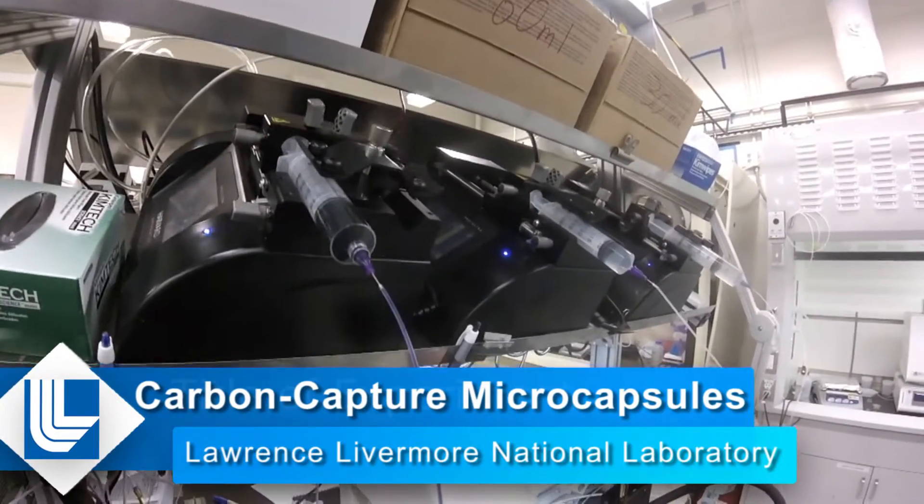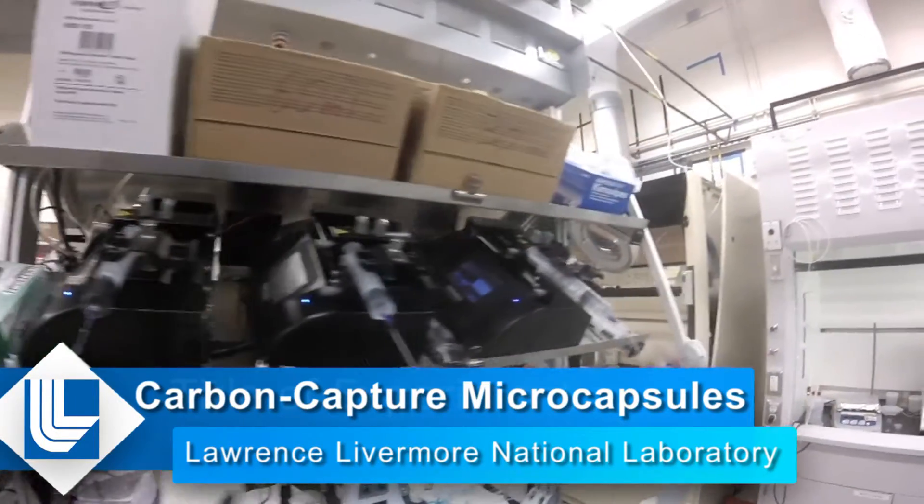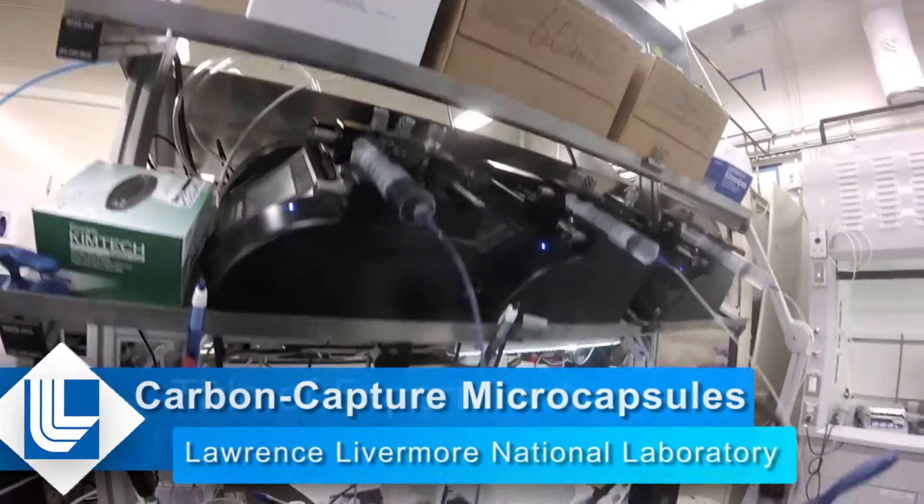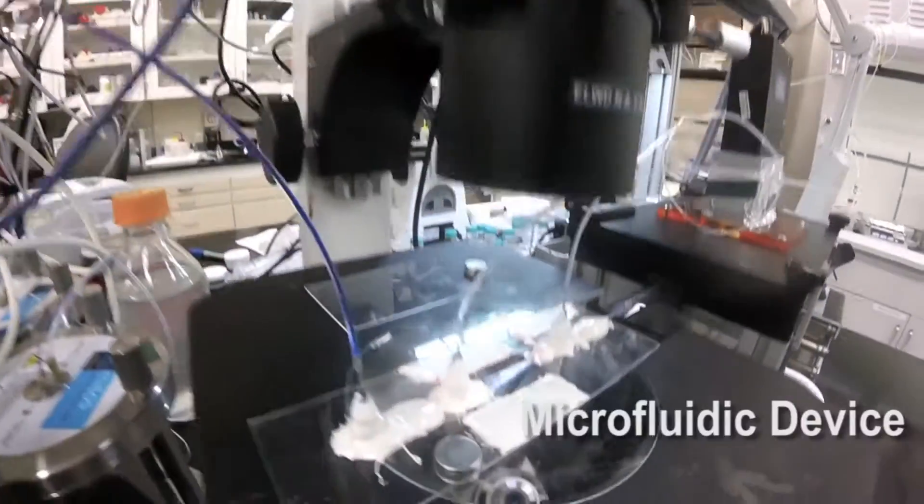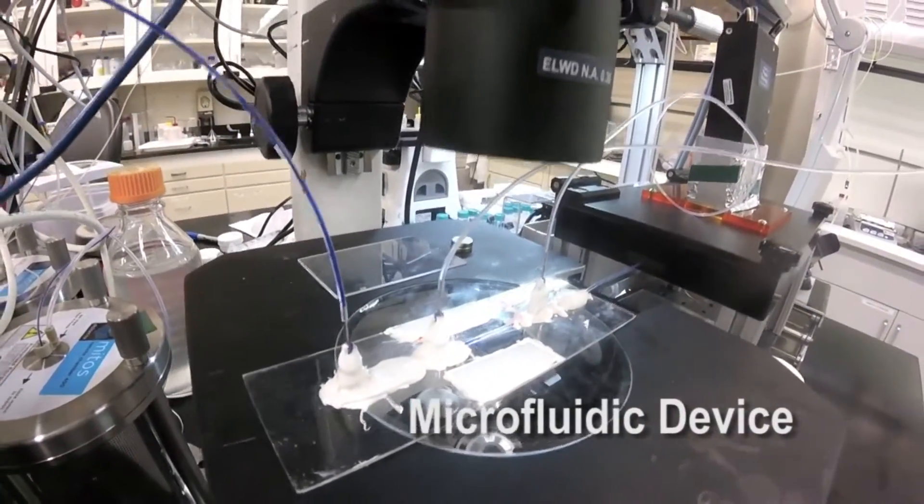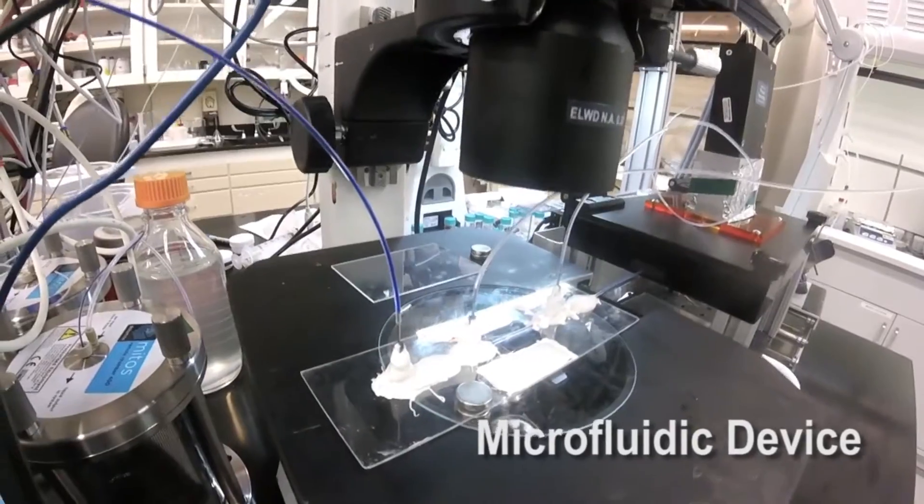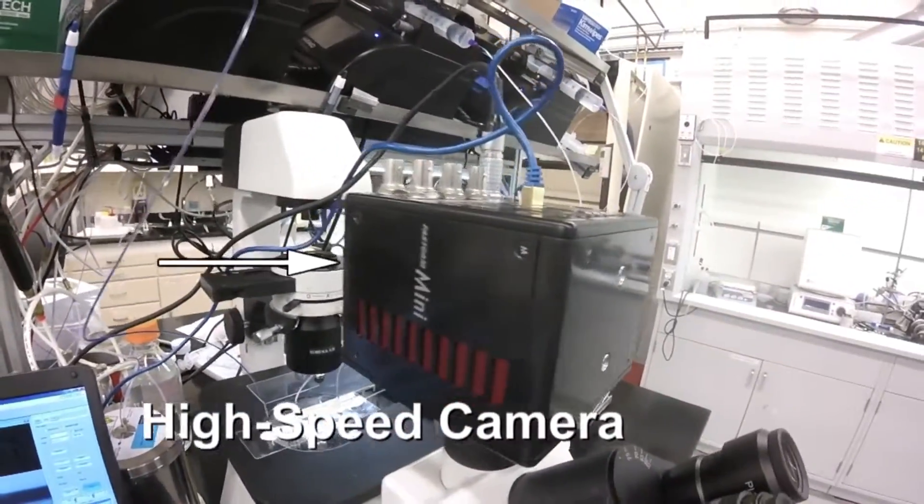After loading these syringes with liquids, they're left on the syringe pump, and then the liquids are pumped all the way to this microfluidic device. Right now we're making double emulsion drops at a really high speed, and that's why we need to use this high-speed camera to help with observation of the droplet generation.